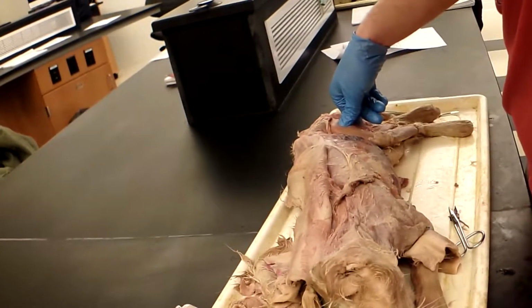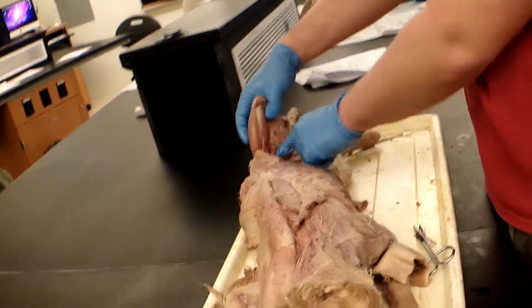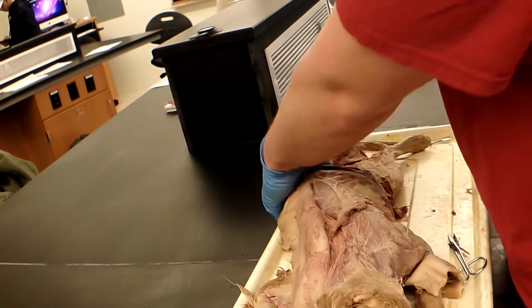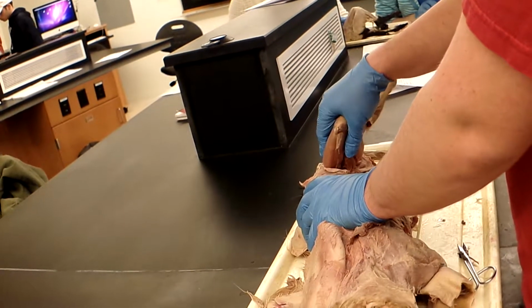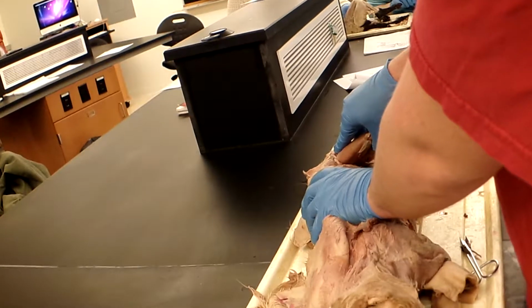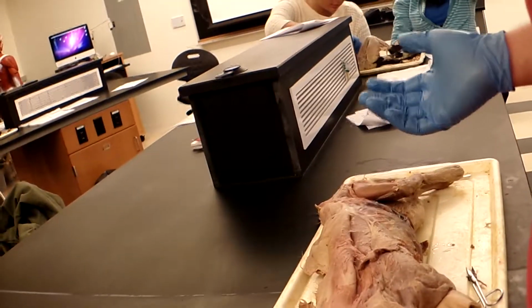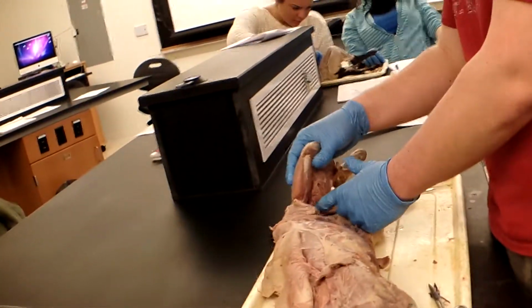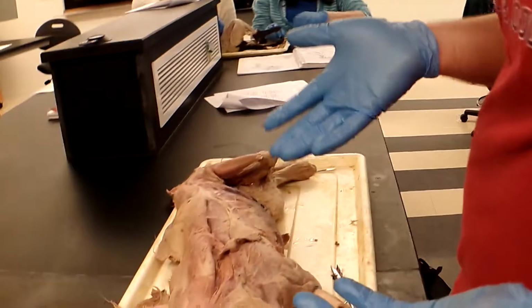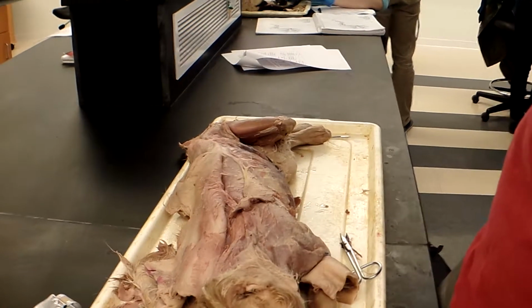Next is the adductor femoris, which is found underneath, right here. The origin is the pubis, the insertion is the femur, and the function is that it adducts the thigh. Next is the adductor longus, which is right by the last one. The origin is the pubis, the insertion is the femur, and it adducts the thigh as well.